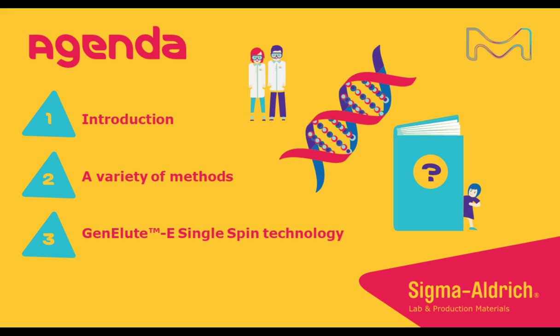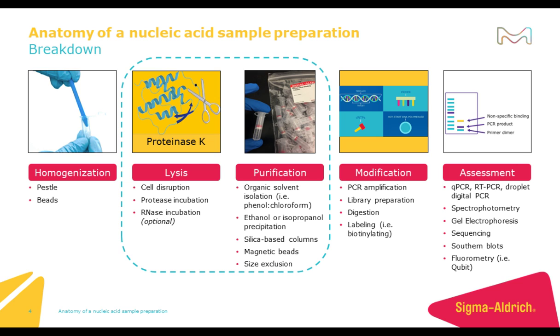Today's webinar, I will outline sample preparation through a short introduction before discussing common methods used by scientists. I'll be highlighting workflows for genomic DNA isolation. Finally, I'm excited to introduce you to a new technology coming soon from MilliporeSigma called GenElute E single spin technology.